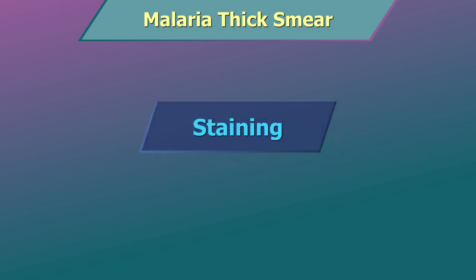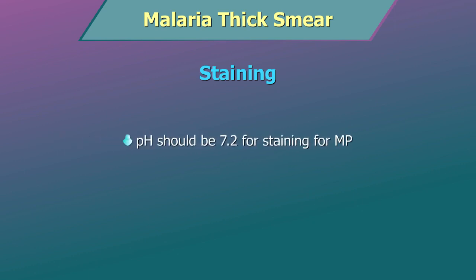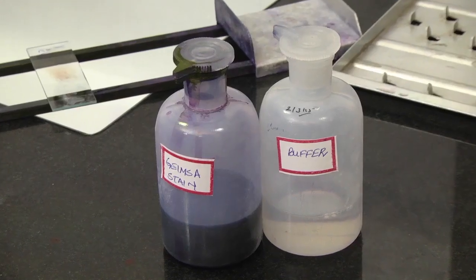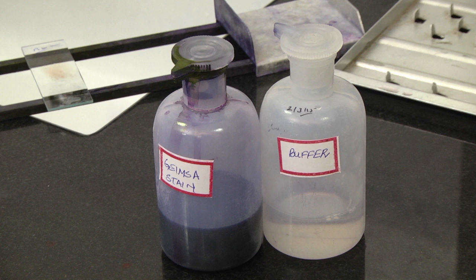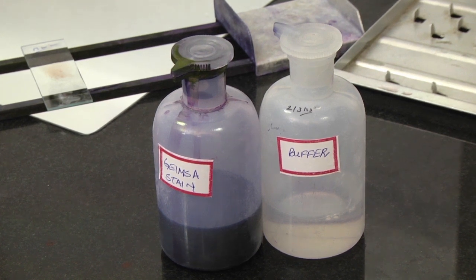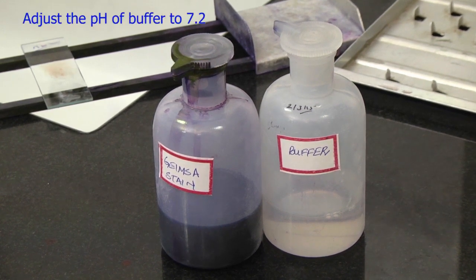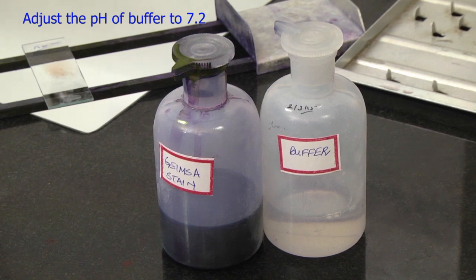Staining. pH should be adjusted to 7.2 for staining for malarial parasite. A number of Romanowsky stains like Fields, Giemsas, Wrights, and Leishmans are suitable for staining the smears. Staining by Giemsa stain will be demonstrated here. If you are preparing your own stain, always prepare it fresh, according to manufacturer's instructions. Adjust the pH to 7.2.